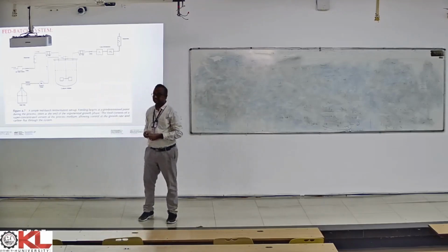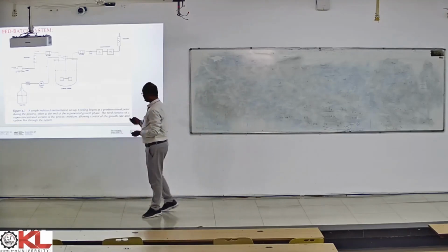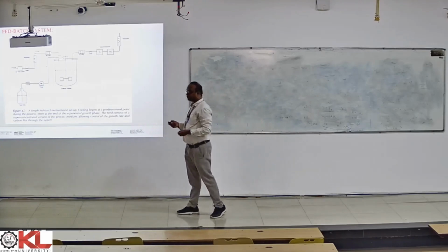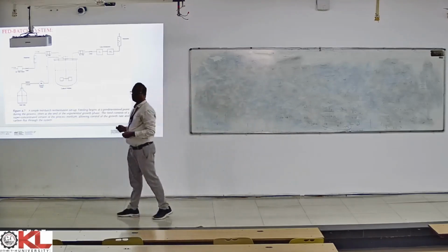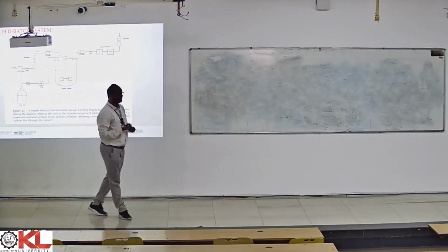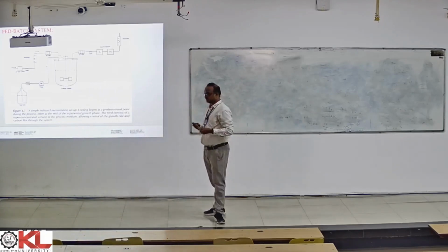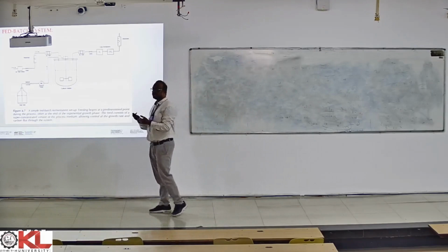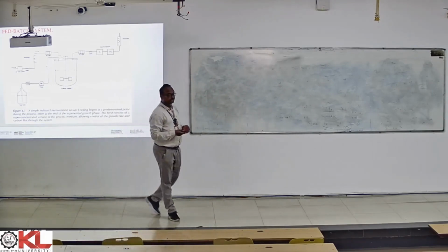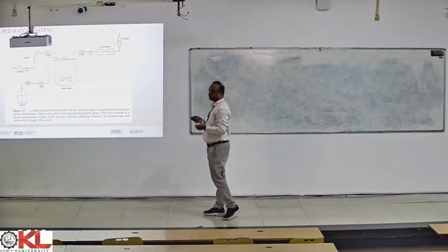So let's continue with the fed batch system. This is the schematic representation of operating a bioreactor in a fed batch system. Till now in our earlier classes, we have been dealing with bioreactors and their modes of operation, looking at how we can operate these bioreactors. First we had a look at the batch mode of operation. Continuing with that, we will start with the fed batch mode of operation.